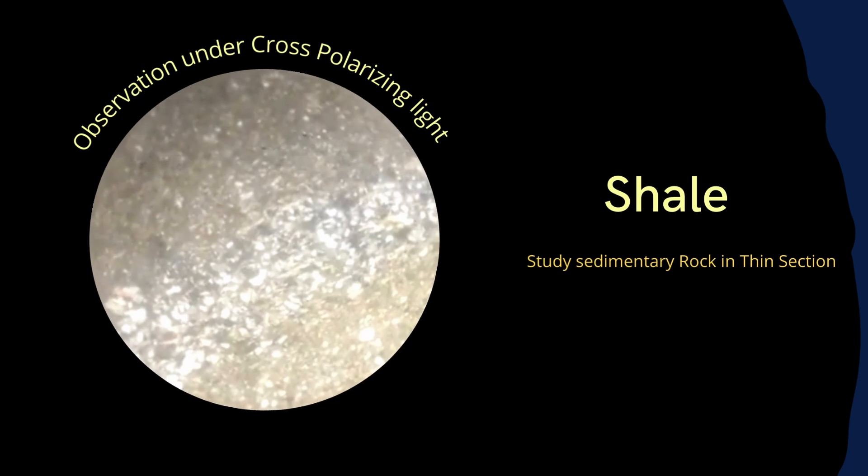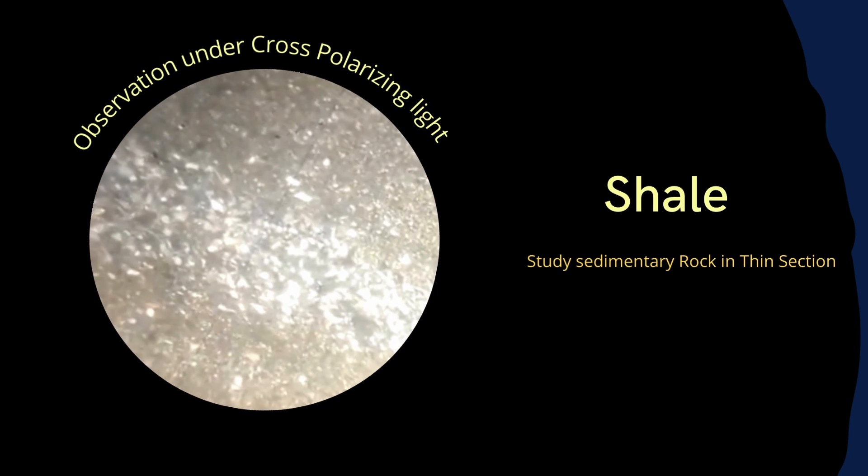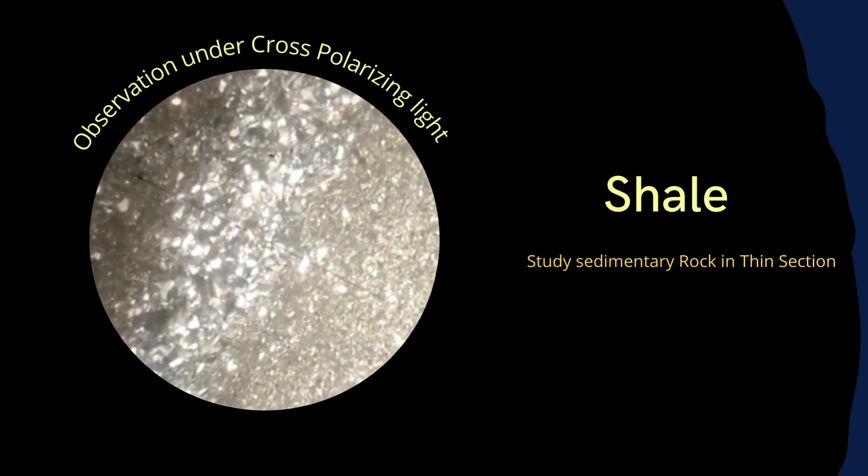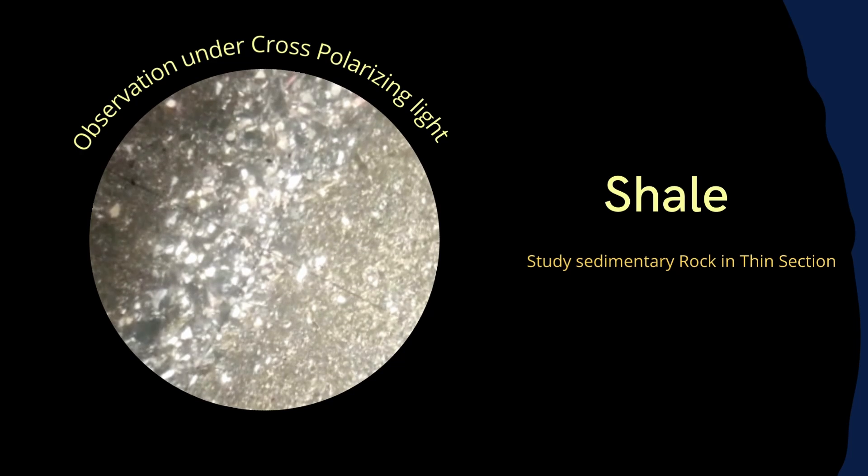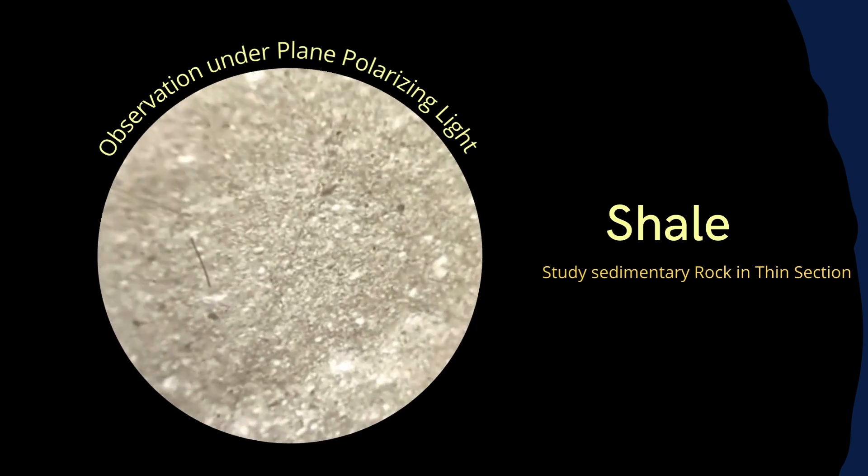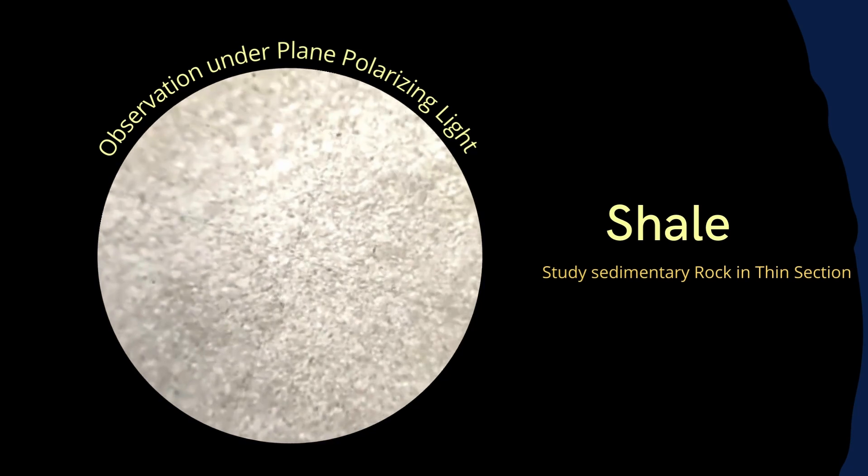Shale thin section under the cross polarized light shows that birefringent minerals like quartz show the interference colors and clay minerals remain mostly dark.